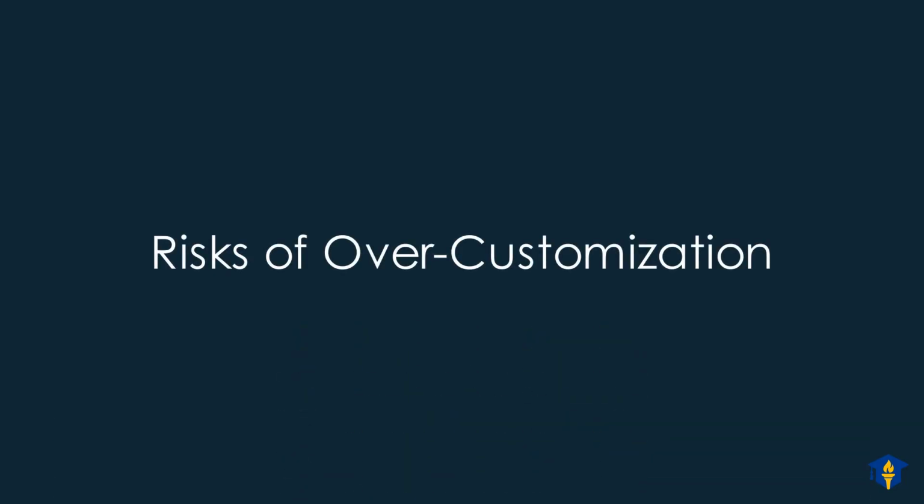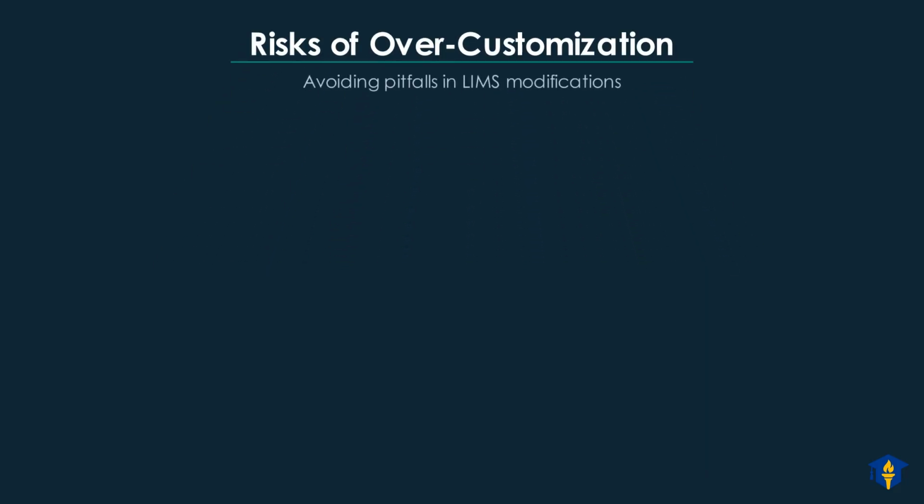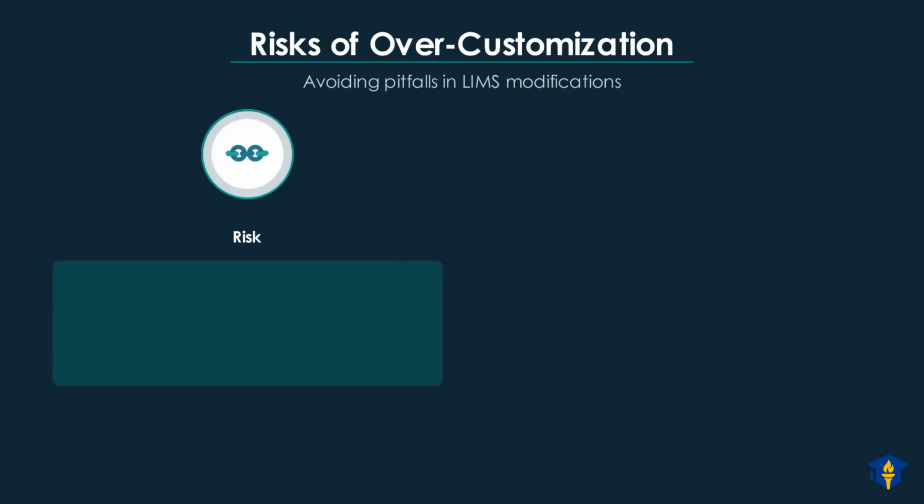Let's now discuss the potential risks associated with over-customization in your LIMS. Understanding these pitfalls is crucial for making informed decisions about LIMS modifications. We'll examine several key risks that can arise from excessive customization. Over-customization often leads to significant difficulties when it's time to upgrade your system.